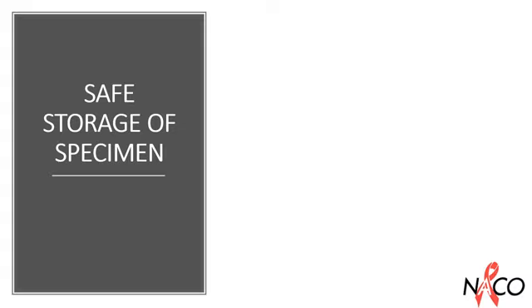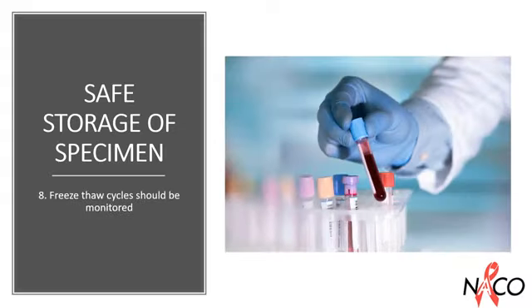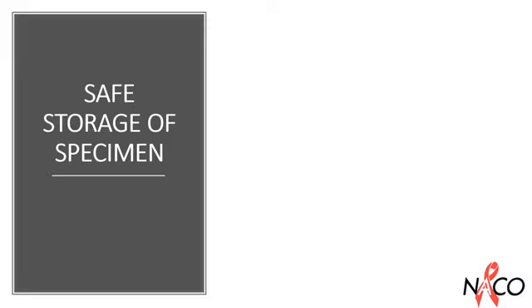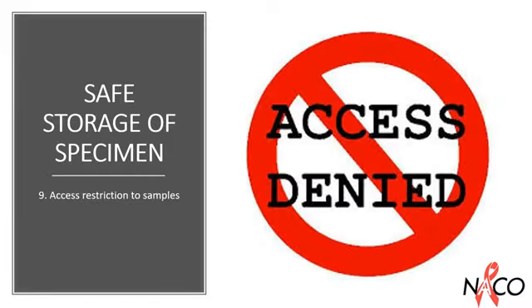Samples that undergo freeze thaw cycles should be monitored adequately. Only authorized personnel should have access to these retained samples. Access restriction to samples is mandatory.